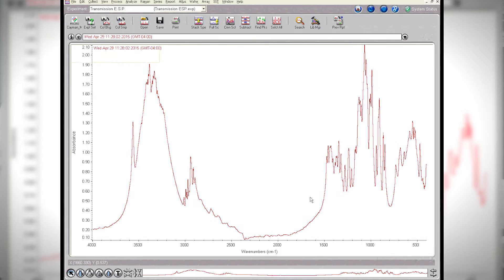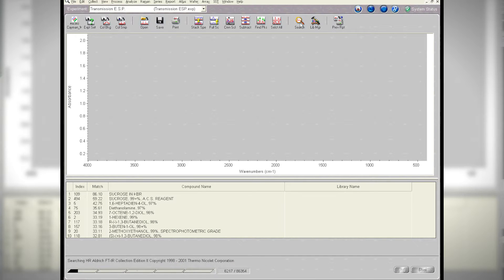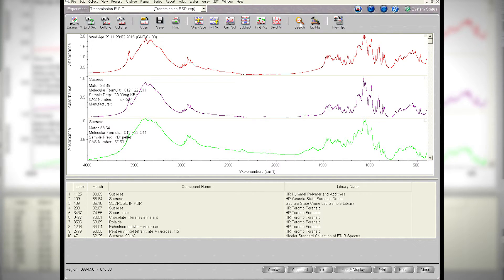Go ahead and just hit enter. So there's my spectrum. I've already got some libraries selected, so let's see if it can tell us what this material is. So we'll do a search very quickly, and the top search result is sucrose, which is indeed what we ground up in the earlier video we put in to the KBr and ground it up.